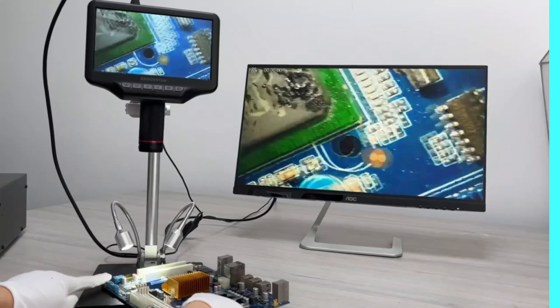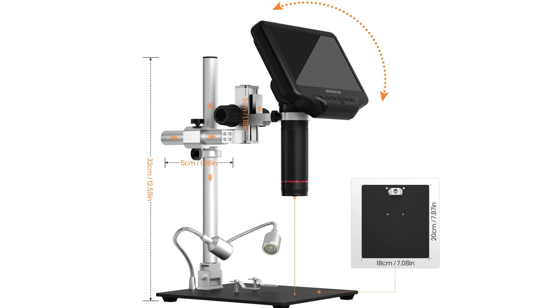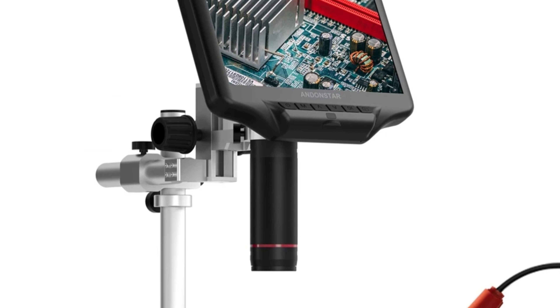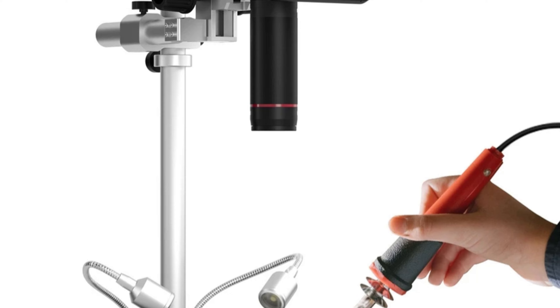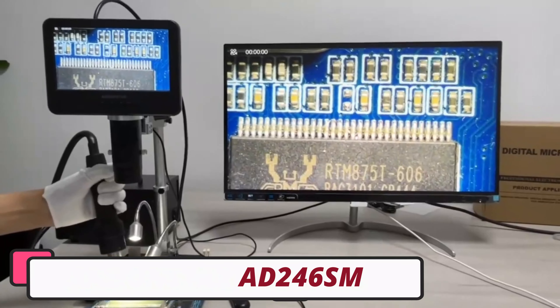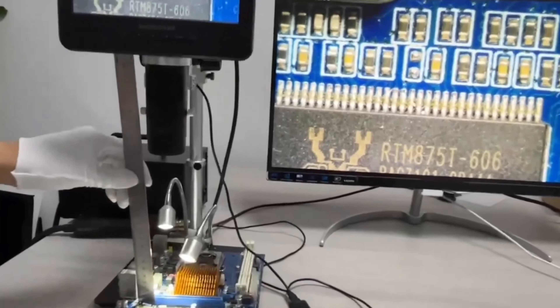Number 2: Andonstar AD407 Pro HDMI Microscope. The Andonstar AD407 Pro HDMI microscope is a cutting-edge device that offers high-definition imaging with a 4-megapixel HD sensor, capturing even the smallest details with remarkable accuracy. It offers multiple video output options, including UHD 2880x2160 at 24 fps, FHD 1920x1080 at 60 fps and 30 fps, and HD 1280x720 at 120 fps, ensuring smooth viewing experiences across various platforms. The microscope is built from durable metal and ABS materials, ensuring longevity for professional and educational applications.